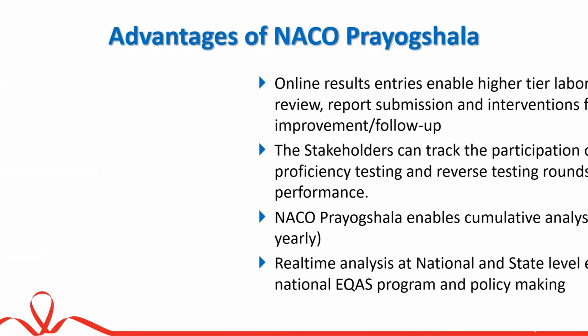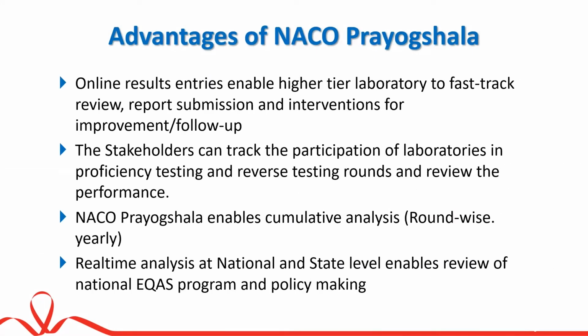Now, what are the advantages of NACO-Prayogshala? The advantage is that online result entries enable the higher tier laboratory to fast track review. Here you can consider the amount of data. Till date, the testing was done by the laboratories, and then reports were sent to the higher tier laboratories. Then the higher tier laboratories compiled and again sent them to the immediate higher tier laboratories.